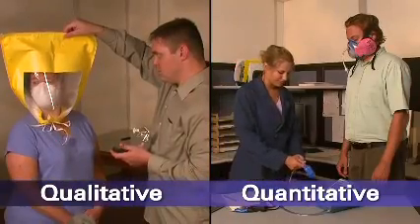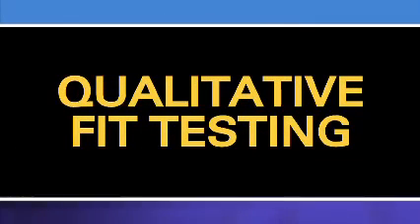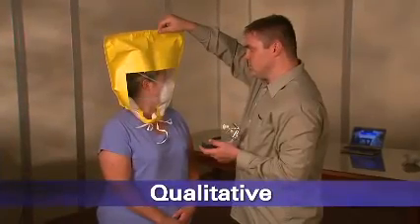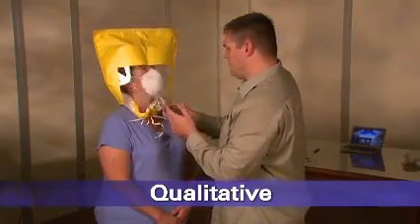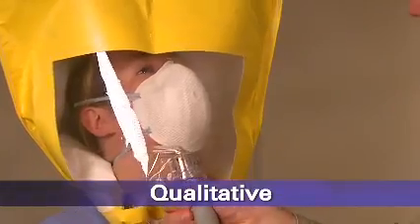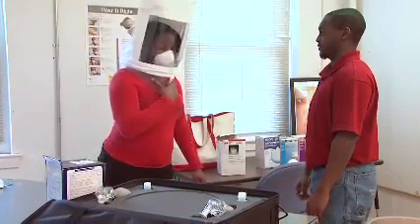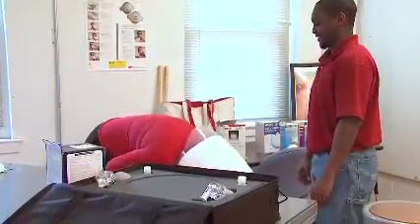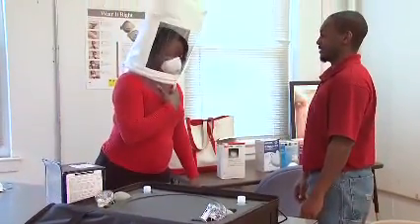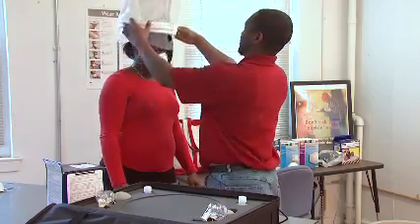There are two types of fit tests: qualitative and quantitative. Qualitative fit testing is a pass-fail test method that uses your sense of taste or smell, or your reaction to an irritant, in order to detect leakage into the respirator face piece. Qualitative fit testing does not measure the actual amount of leakage. Whether the respirator passes or fails is based simply on you detecting leakage of the test substance into your face piece. There are four qualitative fit test methods accepted by OSHA.